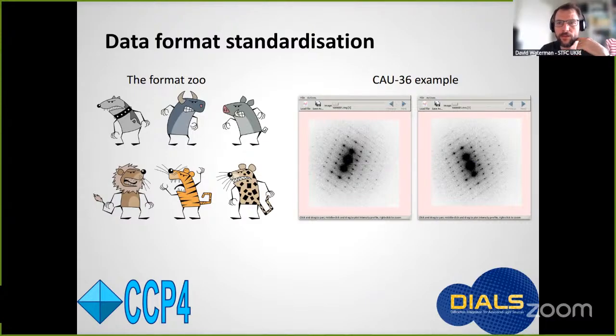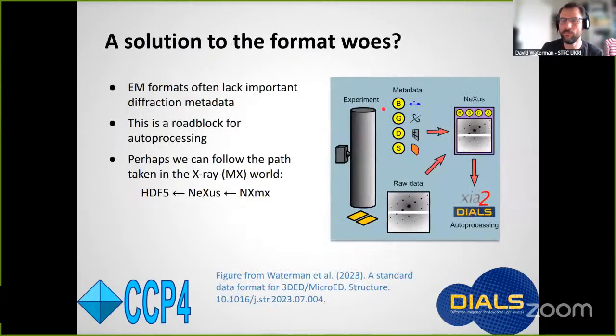If you were trying to use MicroED to do dynamic diffraction-based refinements to resolve chirality of a compound, it's completely possible to get an inverted result simply because of a stupid file format problem. So I've got no doubt one day this will catch people out. One of my goals is the development of a format standard for 3D ED or MicroED. And I think that's certainly not out of reach.